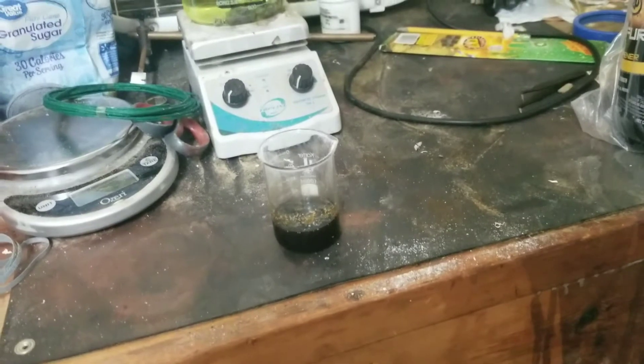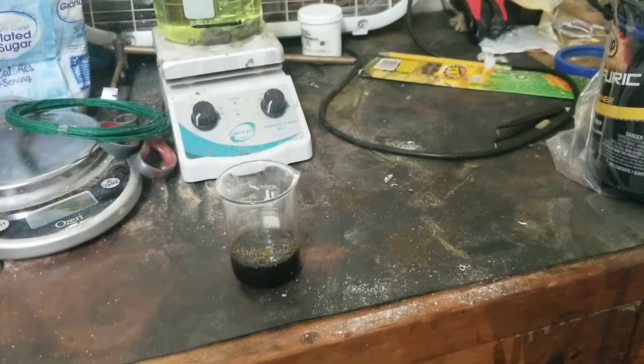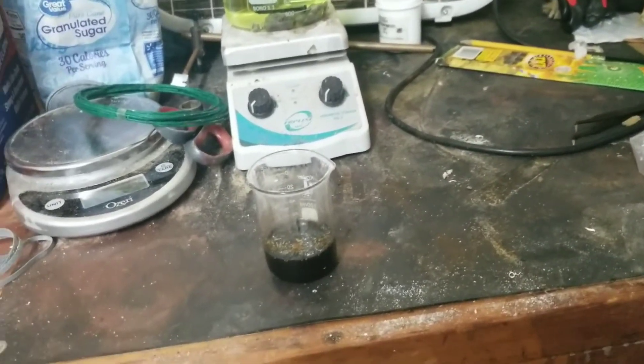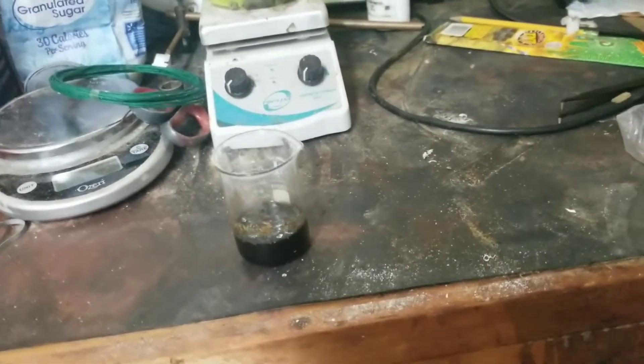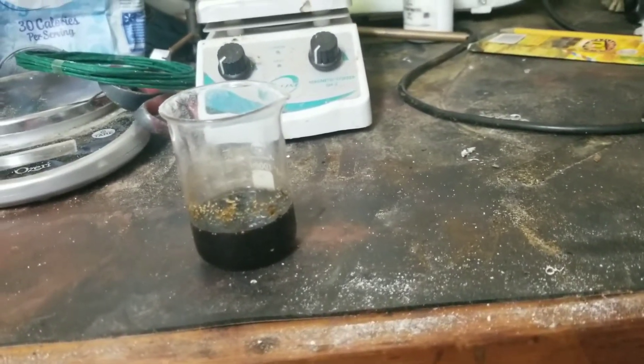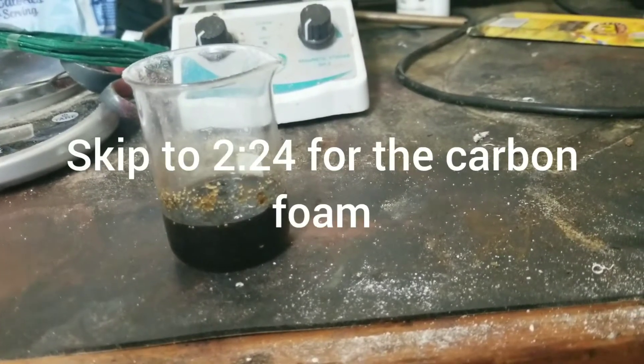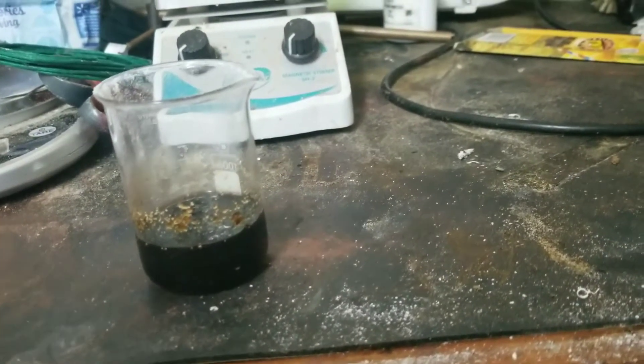The sulfuric acid will turn that into water, dilute itself, and also make carbon — which is why this is turning black. Eventually the reaction will start to smoke because it gets really hot, and it will make some nice carbon foam. Just gotta give it a second.